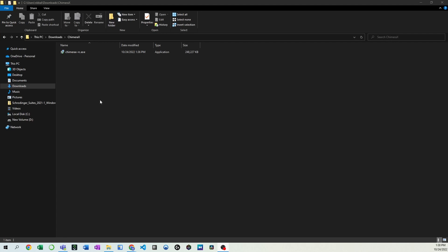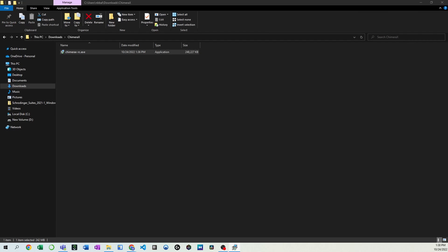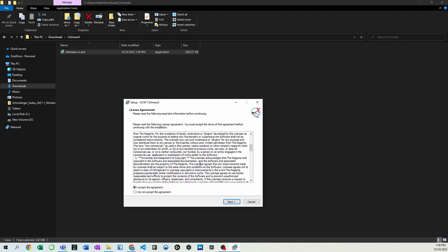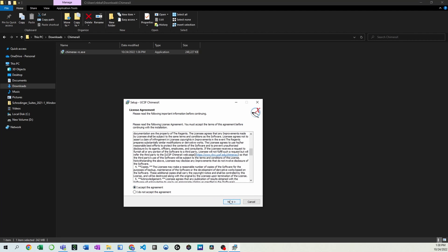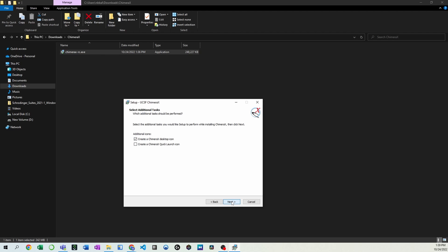Okay, once it finishes downloading, we can go ahead and run this .exe file. Go ahead and accept the License Agreement and allow it to run on your computer. The defaults here are fine, just take note of where you're installing it. The rest of these defaults are fine as well.